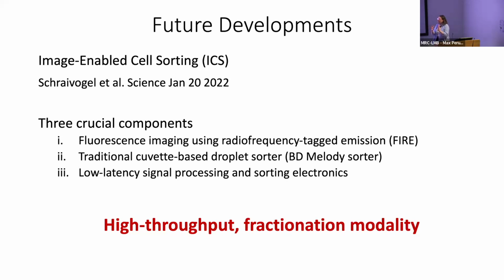So this is not traditional with flow cytometry. You would never get any kind of subcellular localization. You would just get generalized fluorescence. And they made this into a machine where we could actually fractionate out cells of interest. So the field is definitely changing, and changing very rapidly. I think this is the future of flow cytometry, most certainly. People have been working around the world to get this going for, I would say, well over a decade now, but we're getting there.